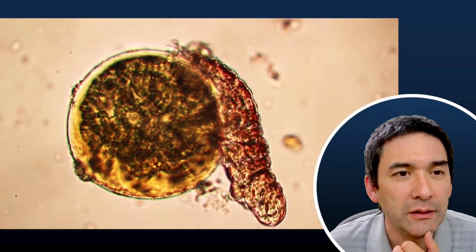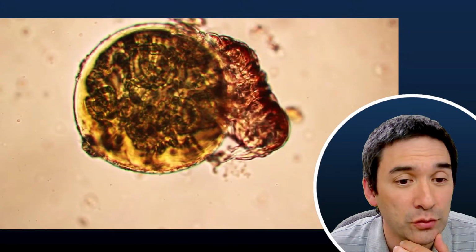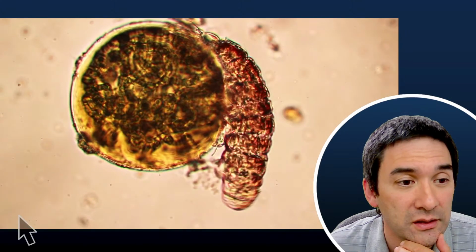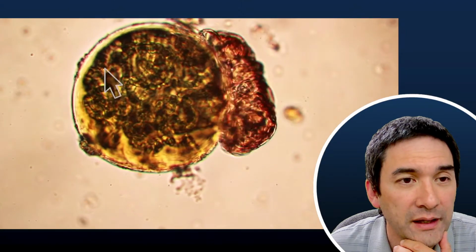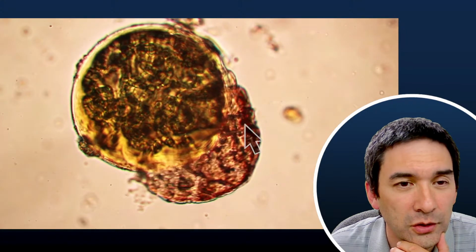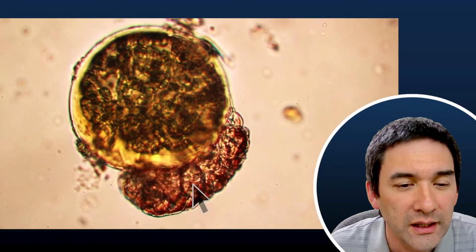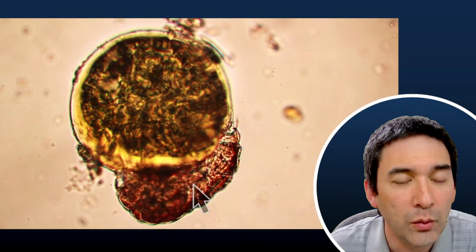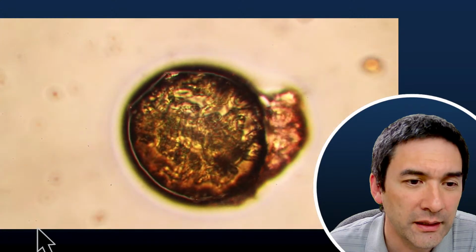That's a tardigrade. I think it's on a, I don't know what the large round thing is here. Okay, where's the arrow? So this large round thing, I don't know what it is. But the tardigrade here, as you can see, really likes to cling to the object, and essentially, I waited for the water to evaporate. So we're going to have a look at that.